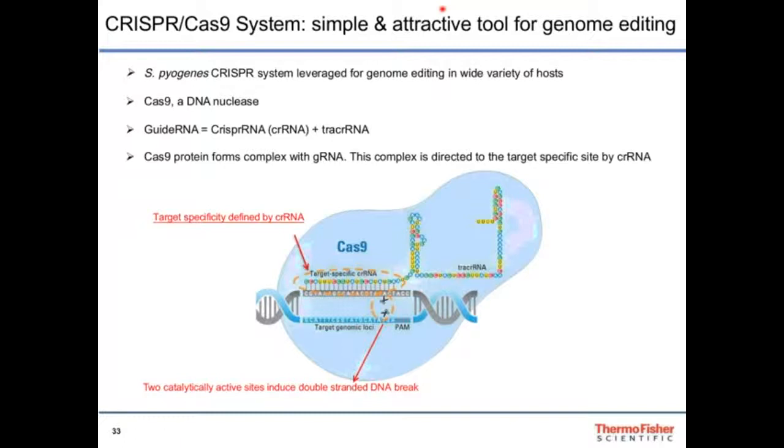We can knock out these nuclease domains one at a time to create nicks, or both to create what's called a dead mutant, to allow us to deliver other types of enzymes to the DNA without cleaving it.